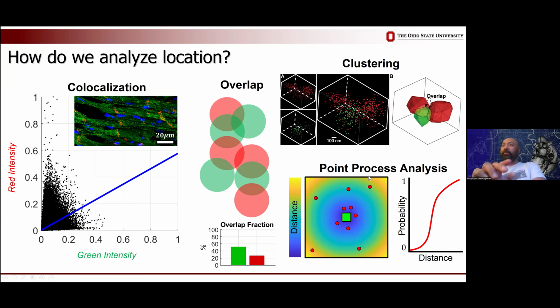We're back on. All right, so point pattern analysis is a really powerful paradigm from spatial statistics that is criminally underused by microscopists. I'll tell you a little bit about that and why you might want to play with it.